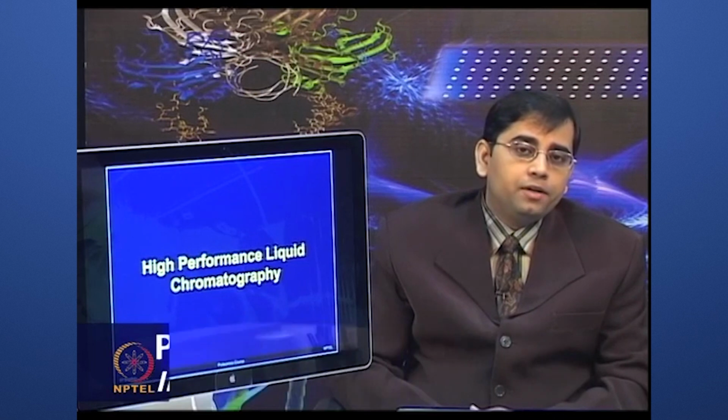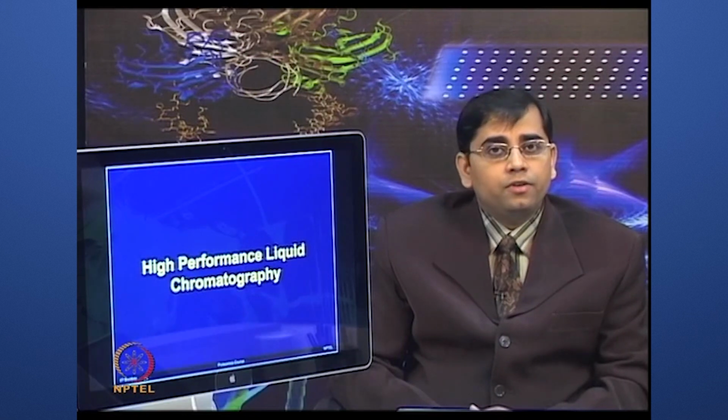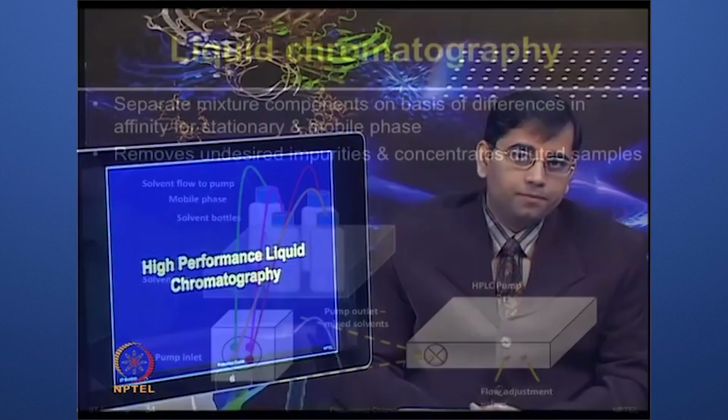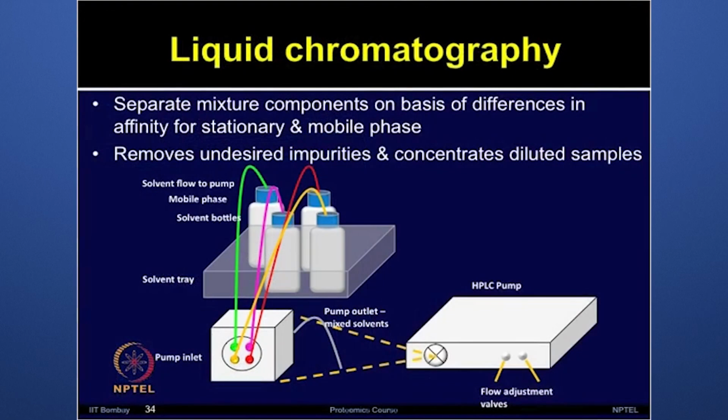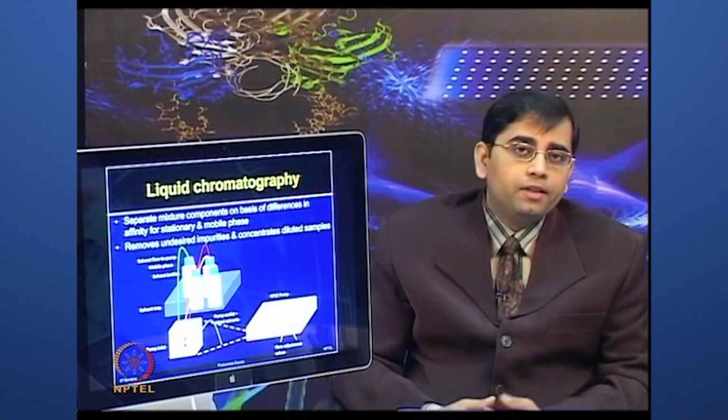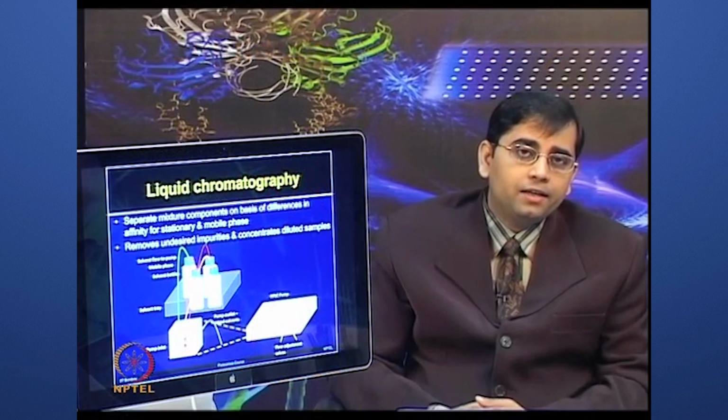Better separation and resolution of the components can be achieved by HPLC. So, what is liquid chromatography? Liquid chromatography separates mixture components on the basis of differences in the affinity for the stationary and mobile phase. It can remove undesired impurities.